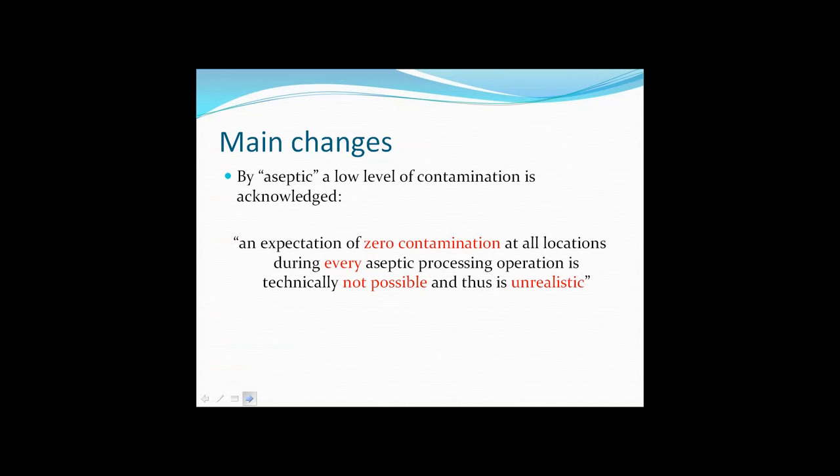The chapter indicates that a low level of contamination over a given period of time is considered to be, in some senses, expected and possibly even normal. And this is because the presence of people and the limitations of the current clean room and isolation technology will occasionally result in the detection of microorganisms.